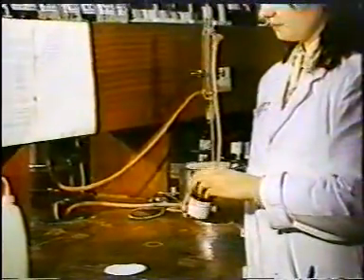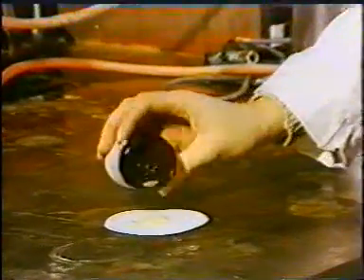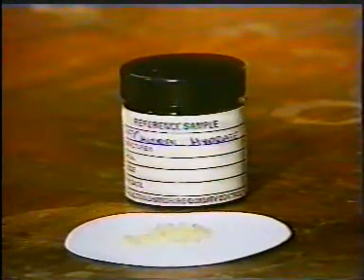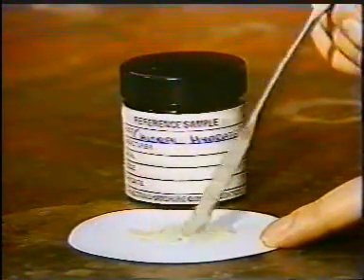The first step in testing a raw material is to check that its appearance is satisfactory. Sometimes raw materials may be rejected on appearance alone. Here, for example, are some chloral hydrate crystals, which are pale yellow instead of colourless.